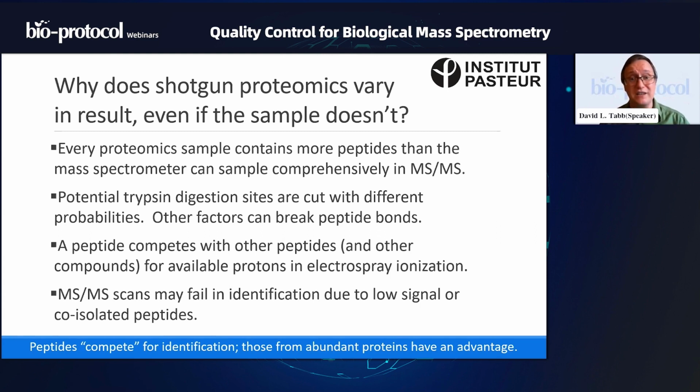And there are other things that can break peptide bonds. Remember, we're throwing something like 3,000 volts through these as they exit the chromatography, and sometimes you zorch the peptide such that a long peptide breaks at a bond, and you now have something that looks like something other than trypsin was cutting it. And certainly in biological samples, there are other proteases at work, so we have to take those into account too.